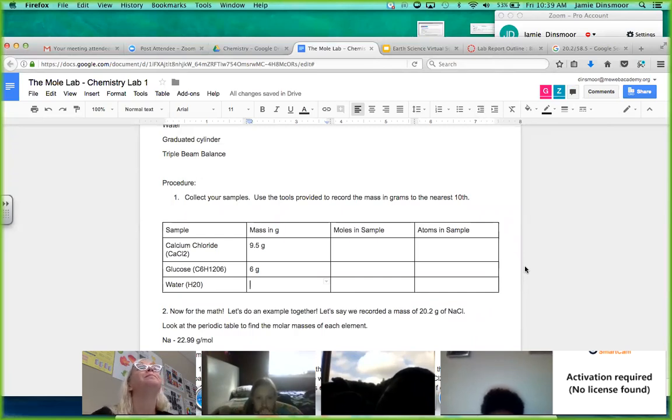Okay. I got 65.7 grams for water. The water is 65.7 grams. Yes, you guys should write this down as well. Okay, so that is our 3 masses that we just recorded in the lab.